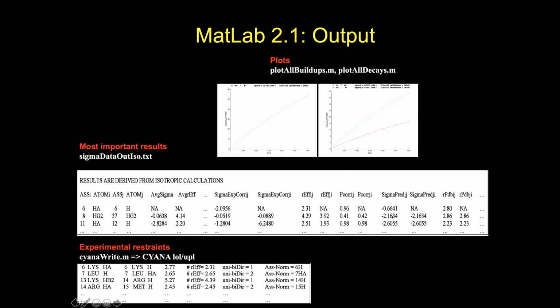Then you see some data that came in from the original PDB file that's shown here. You see the distances in the PDB file. So interestingly, in that case, this distance is much shorter than what we measure. This means that the original PDB input, it was some kind of X-ray structure, I guess, was not very precise. And you get many more information here.